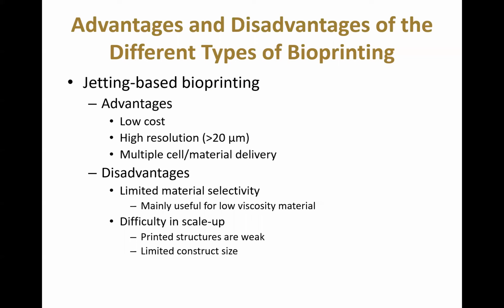There's some difficulty in scale up. The printed structures are weak because you need to use hydrogels, the low viscosity hydrogels. And because the structures are weak, there's really a limit in construct size.